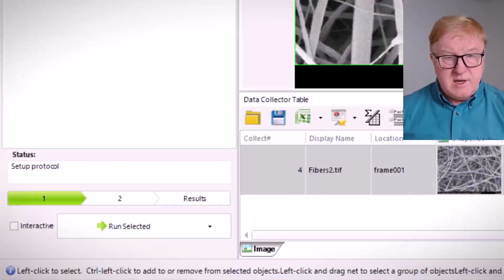Today we analyze images like this. We had images with different noise levels and different thickness, and we found an automatic way that would generate measurements on every image, on every fiber, and create statistics. Let's go step by step to explain how it's done.